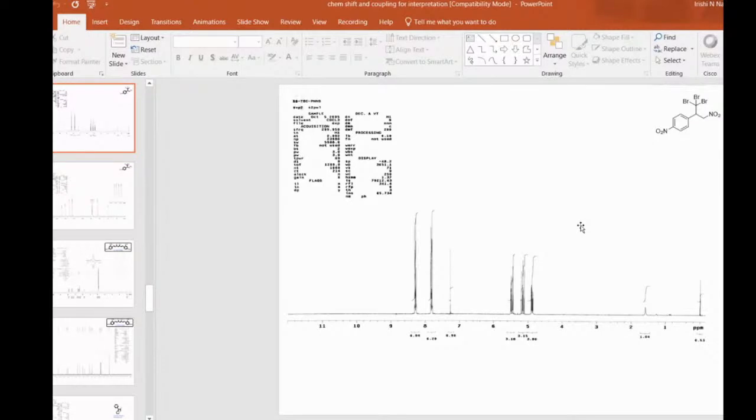Okay. Because those are metal complexes, the metals can either shield or deshield, depending upon the situation. Very good separation of signals is possible using shift reagents. So one can play with different reagents as well, in order to change the chemical shifts. In addition to the groups or atoms already present in the molecule, one can also use external reagents to change the chemical shift, get better resolution, and so on.